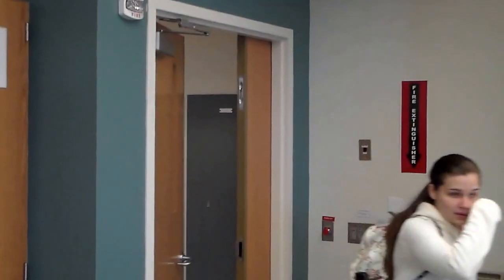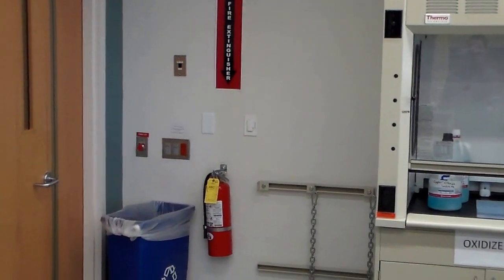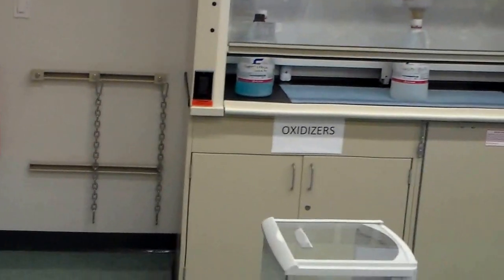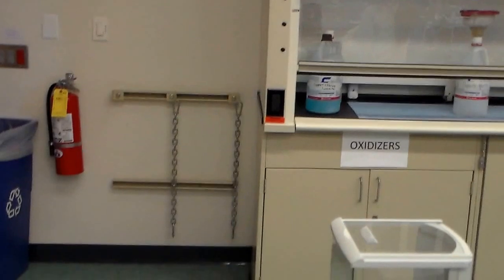Since we had a tornado warning last week, let's go through where all the safety equipment is. There's the door where you entered. Right next to it you can see there's a fire extinguisher. You can also see there's chains there. Those chains are used to secure a tank if there's ever a tank over there.